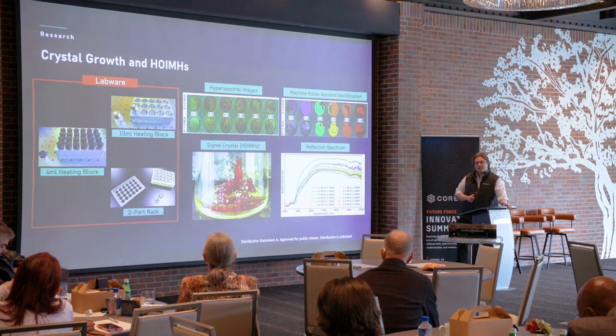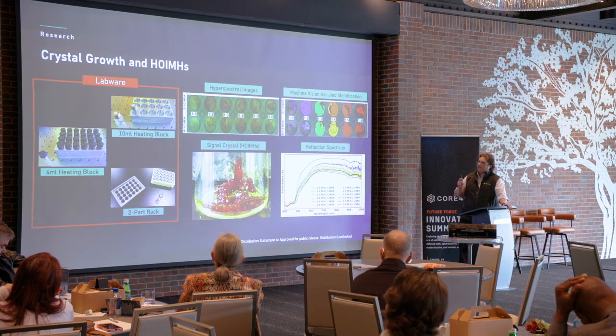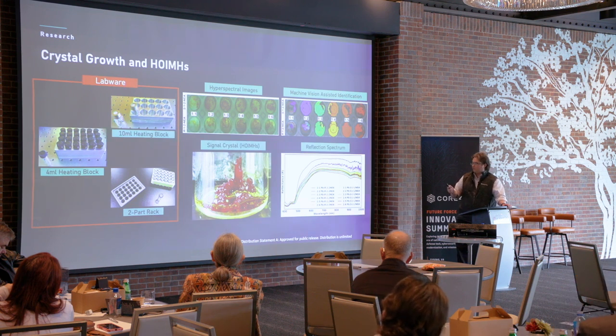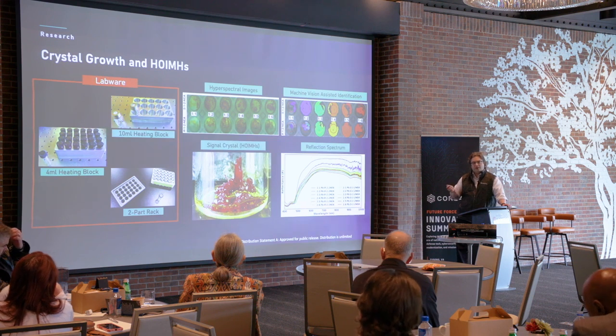So a big area of research that we are currently doing is our crystal growth and our hybrid organic inorganic materials. In this particular set of experiments, we grew these crystals in cell 1 using both cell 1 and cell 2.